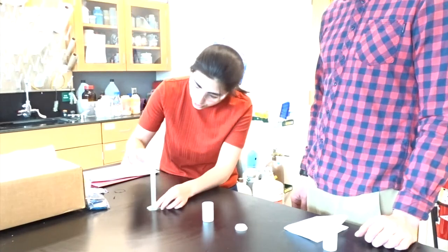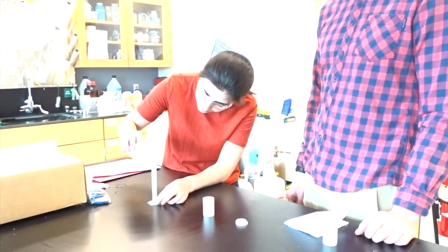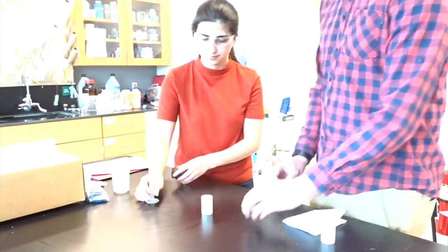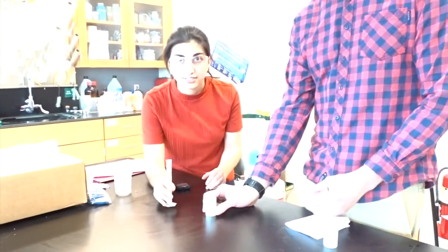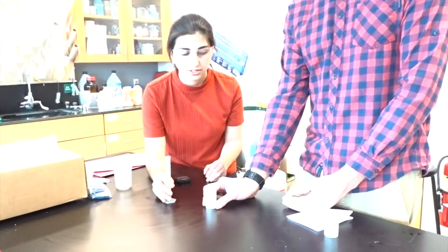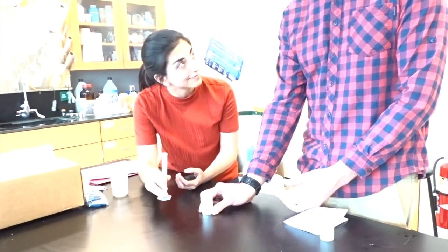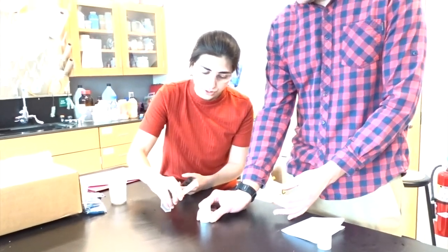So like we did before, we're going to measure out another 10 milliliters. And just to reiterate, when we add the water, we should quickly seal the film canister and make sure that the top is on tightly to avoid gas leakage. Ready? 1, 2, 3.